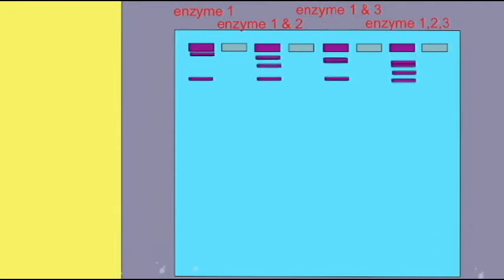Now enzyme 2 obviously only makes one cut, because there were originally two bands of DNA, and in the second lane there are now three. So enzyme 2 made one additional cut.